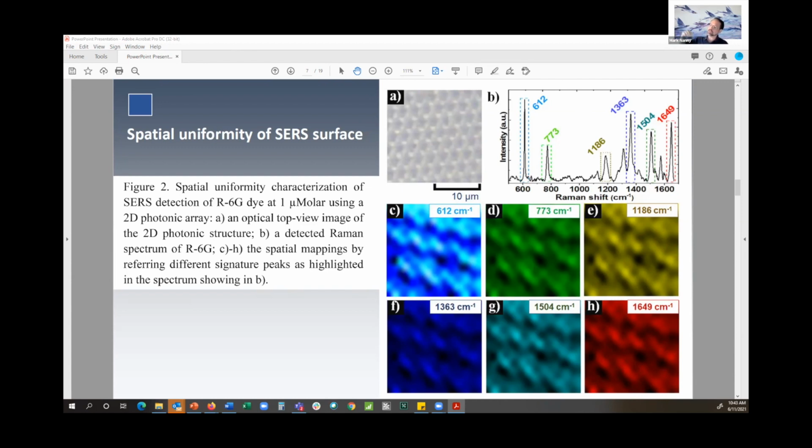So when we take multiple measurements of that nanophotonic chip region, we are getting similar values, and then we can take the average of that, find the standard deviation, etc. And so one of our first steps toward that was this image A, one of our 2-dimensional photonic structures.